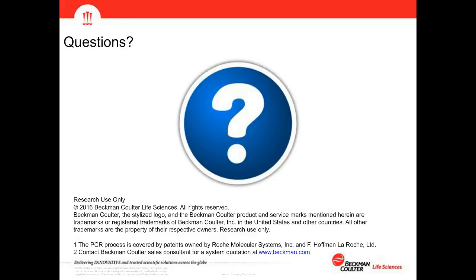As far as custom modifications, that all depends on what the customer is going to need as compared to our template method. But typically, it'll add an extra day for a shorter protocol, or possibly 2 days for one of the longer capture protocols, for example, to implement those changes at the customer site. Ideally, those modifications or changes are addressed prior to the application scientist visit, so a lot of those can be dealt with prior to the visit to help speed up the time when the application scientist is actually on site.